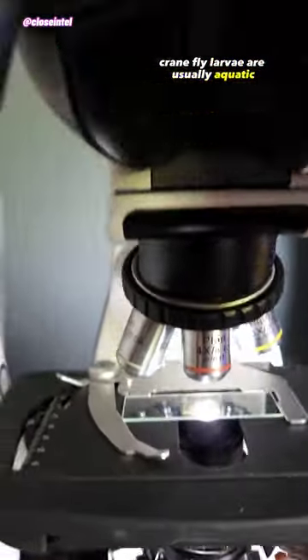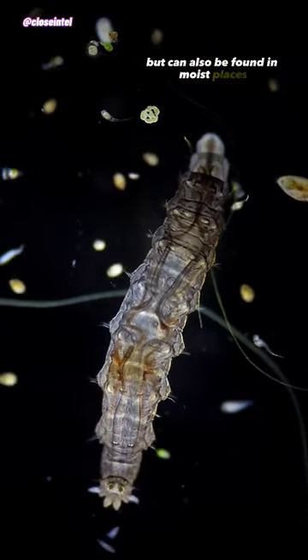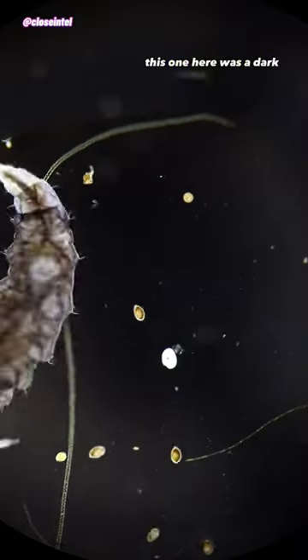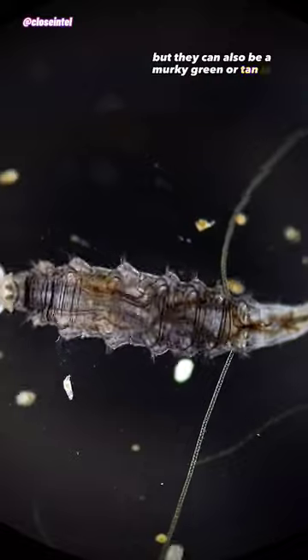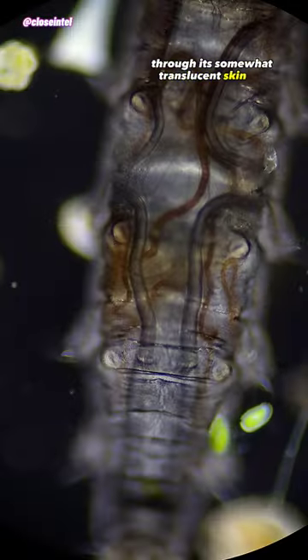Crane fly larvae are usually aquatic and can be found in streams, lakes, or ponds, but can also be found in moist places like under leaf litter or even underground. This one here was a dark shade of gray, but they can also be a murky green or tan in color. You can easily see its innards through its somewhat translucent skin too.